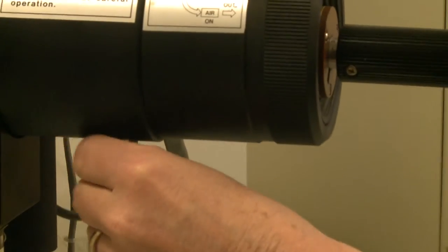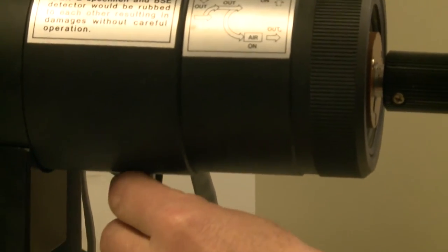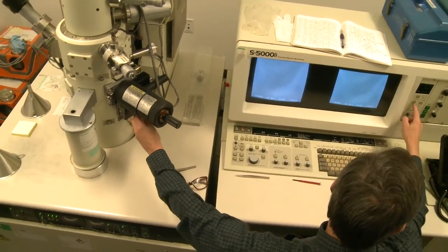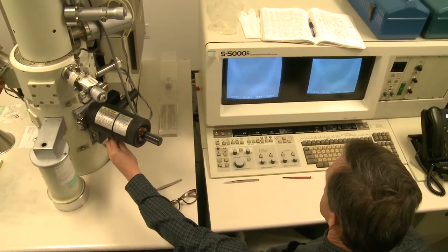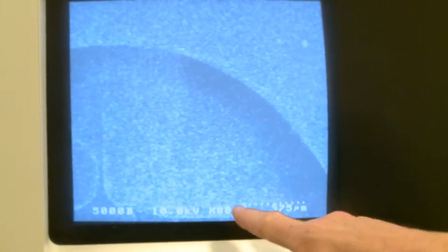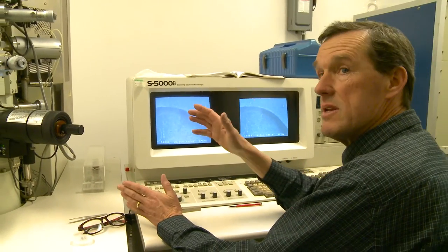Let's see if I can focus on anything here. I'm right now in a fairly low magnification range — this is 80 times magnified. This microscope can do up to a million times.